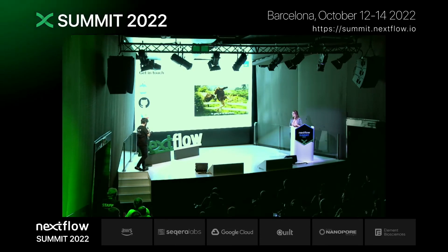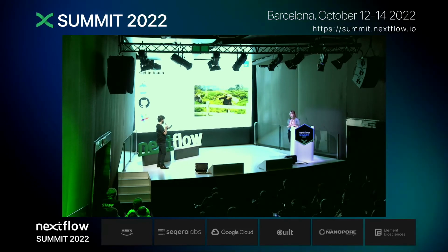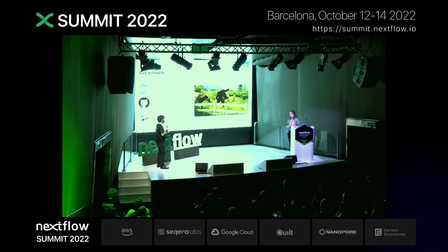So I have a question from Aaron. He's asking, which variant callers have performed the best? Are there any you wouldn't recommend?